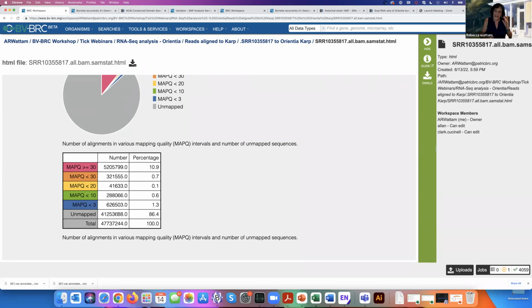I play it, you can map it to the human genome. You can also just use the SRR numbers in it without mapping it to anything. So you can do all of that. But actually, at the time I did this, it was throwing an error on the human genome because it was running out of time, which we fixed at the time. So this was my way to weasel around it.